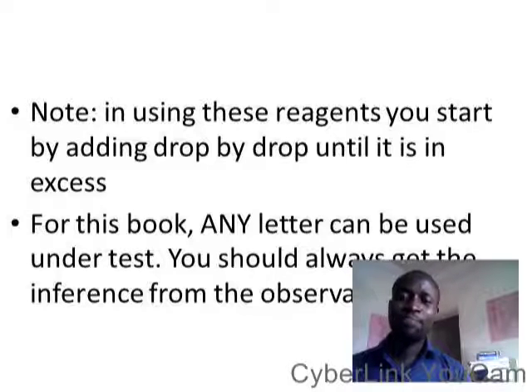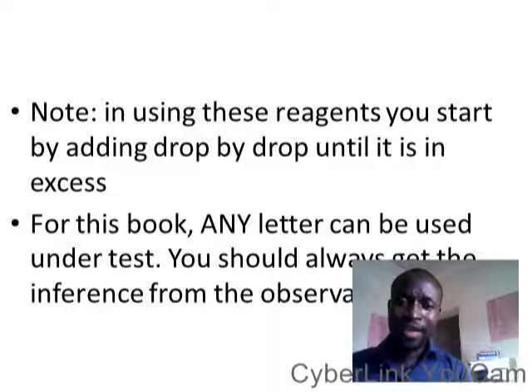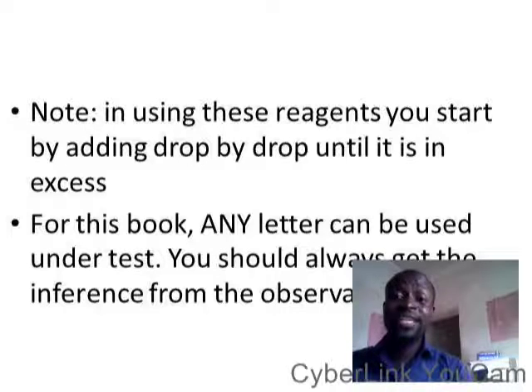For this page and this presentation, any letter can be used under test. What I mean is letter A could be used, letter B could be used, letter K could be used, letter P could be used under test, because we are going to do test, observation, and inference. You should always get the inference from the observation. When you look at the observation, the inference will naturally come to your mind.